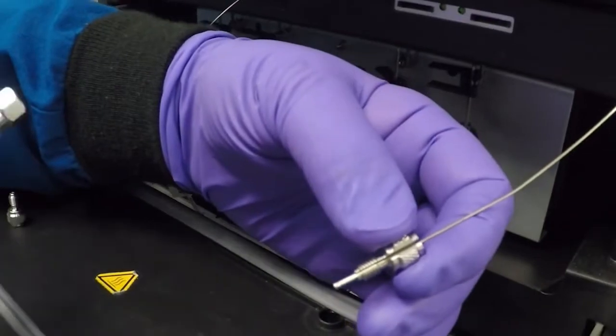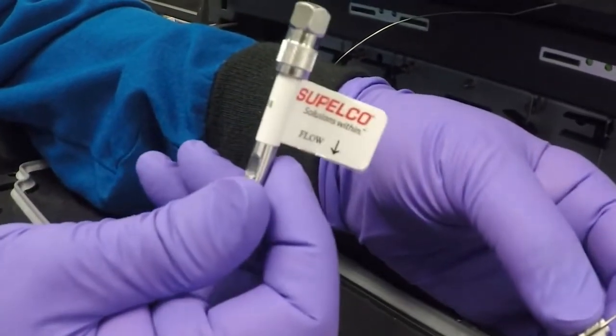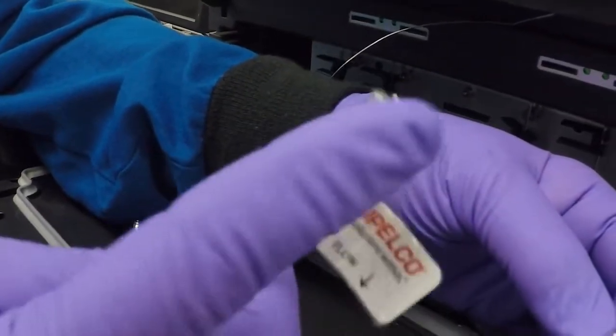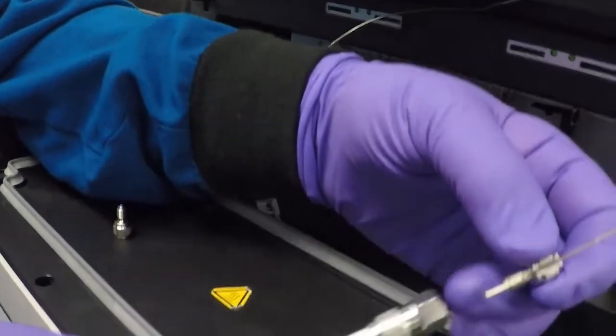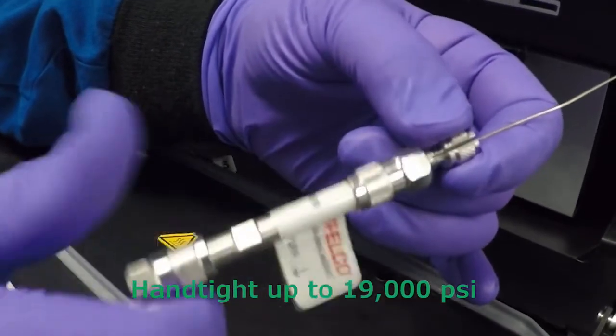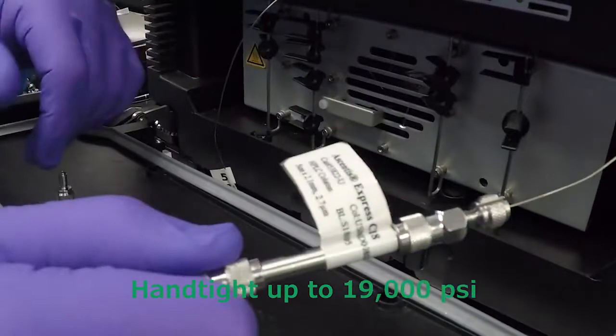You want to install that into the column. Always look for the flow direction on the tag of the column — on this one, the upper part is the inlet, coming from the injector, so we're going to put that in there. Just place it in and spin it right on. This is a hand-tight fitting.